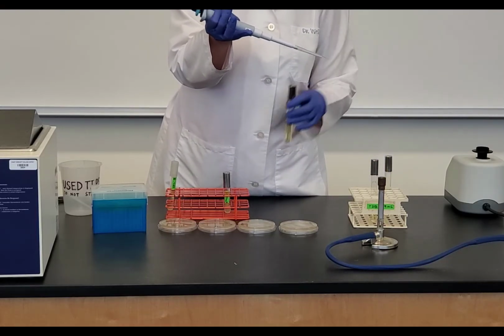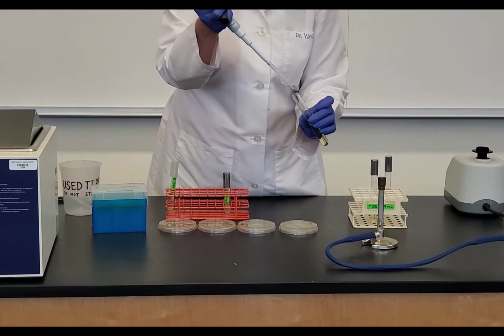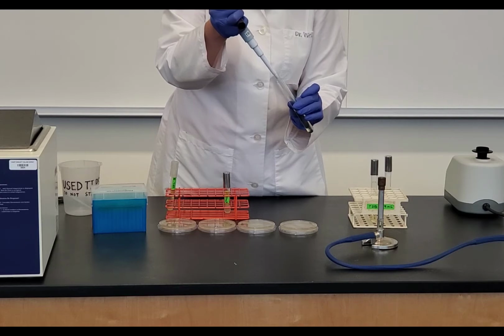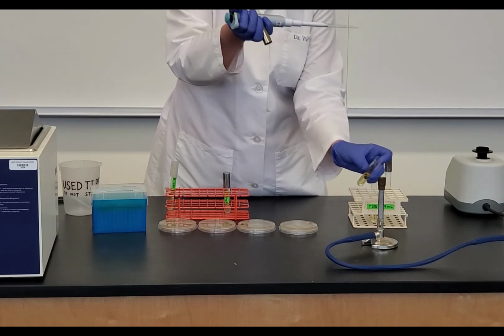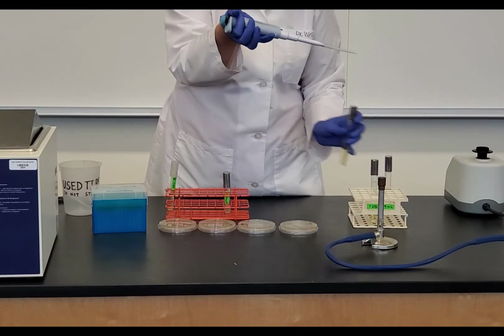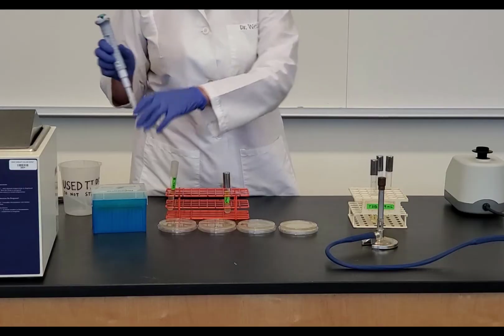I'm going to add it to the 10 to the negative 4. Cap between pinky and ring finger, flame the opening, push to the second stop. We want to get all that liquid out of the tip. Flame it, cap back on, put that here, eject, get a new tip.